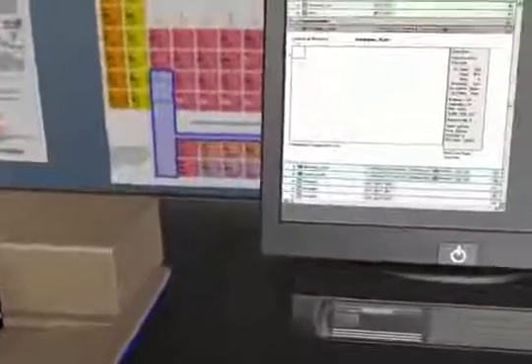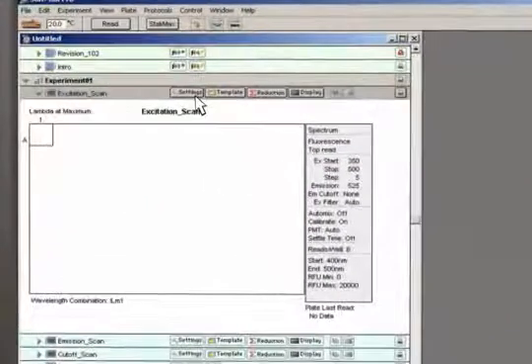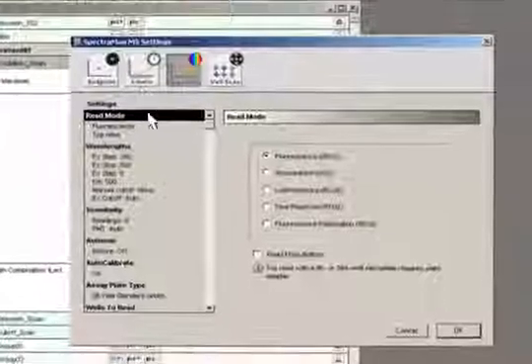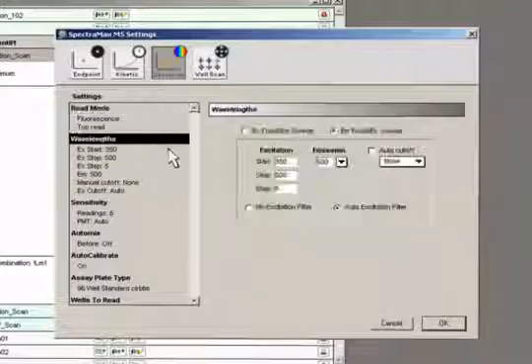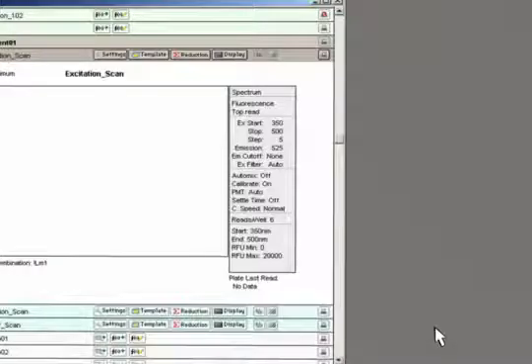The brain of SpectraMax is our market-leading Softmax Pro software that is powerful but easy to set up and use. Let's optimize the settings for reading a fluorophore. First, we select the wavelength range to scan for the excitation wavelength. We will leave the emission wavelength fixed with a rough estimate.